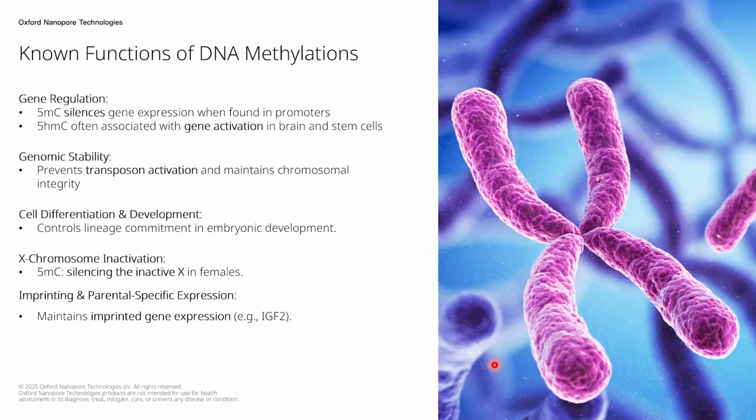So in XX cells in the body, you have a silenced X chromosome, and you can find methylation information on that chromosome using our approach.